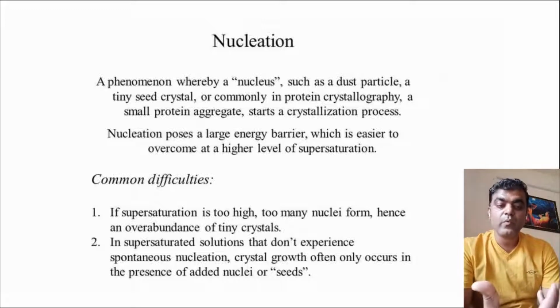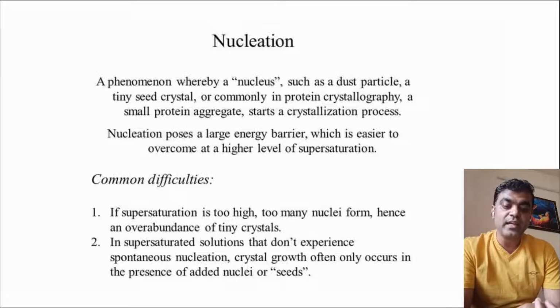Now what will happen when in a small area you have too many tiny crystals? The uniformity and the uniform growth of all these unit crystals will not be there, and they will squeeze into each other's space, giving a non-homogeneous crystal structure.